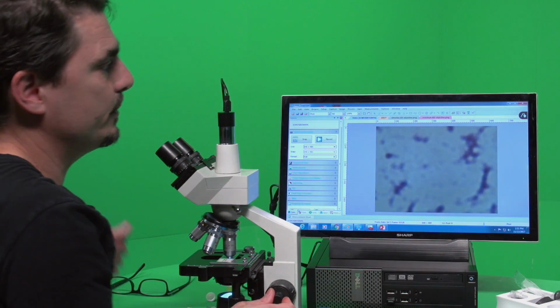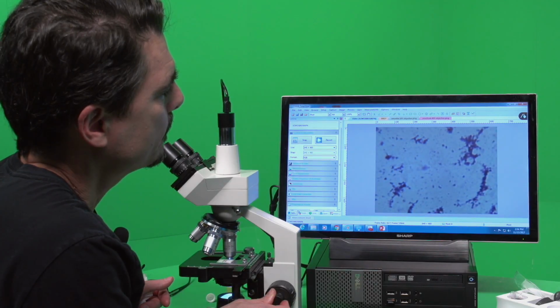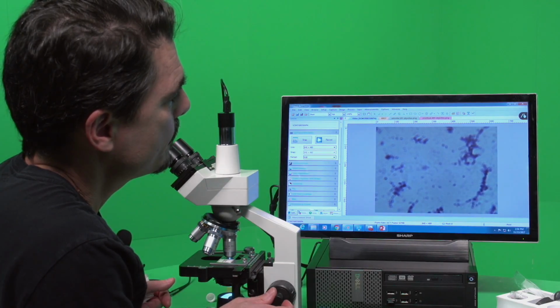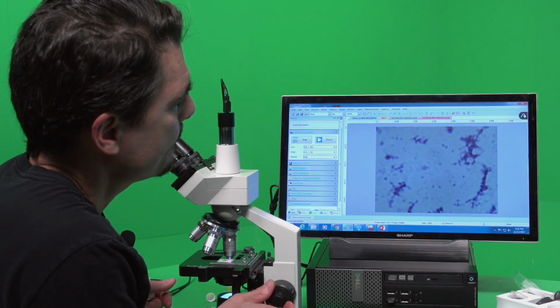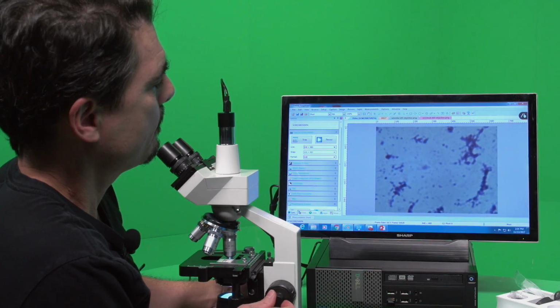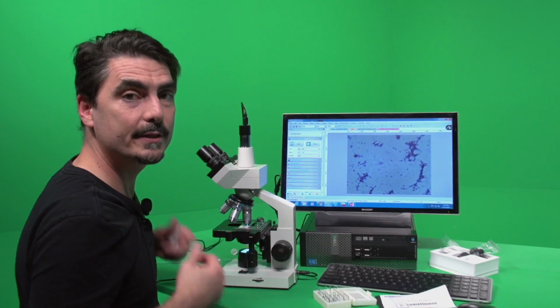But from this slide, part of what you do is you take your image. All right, so go ahead and snap that image with the snap and then save.